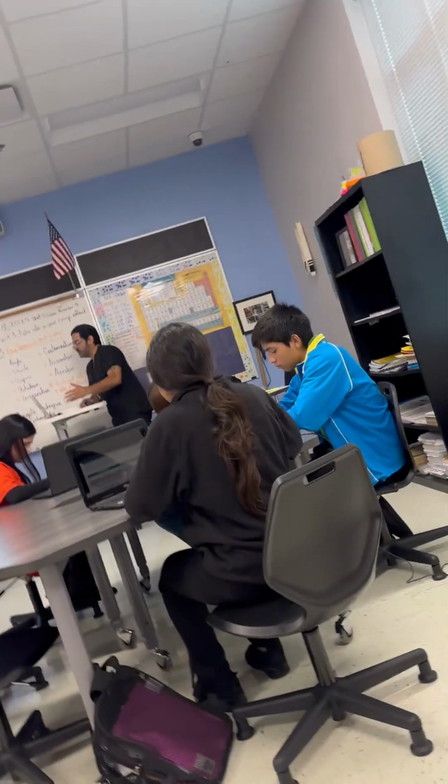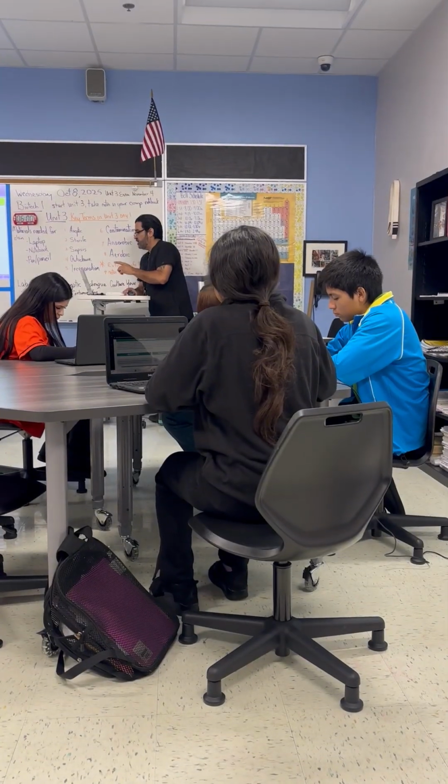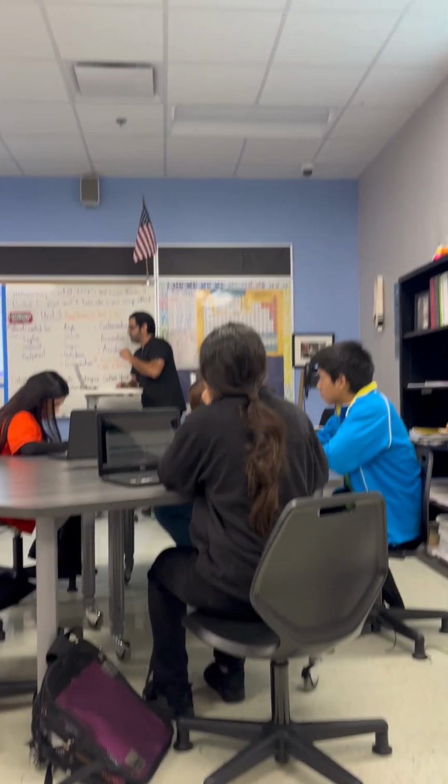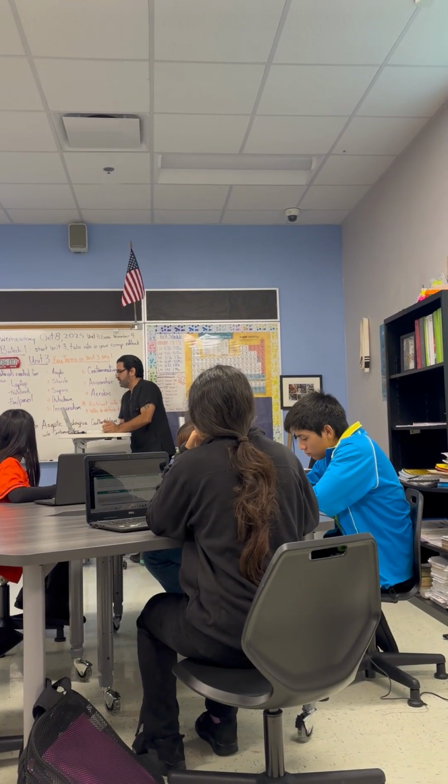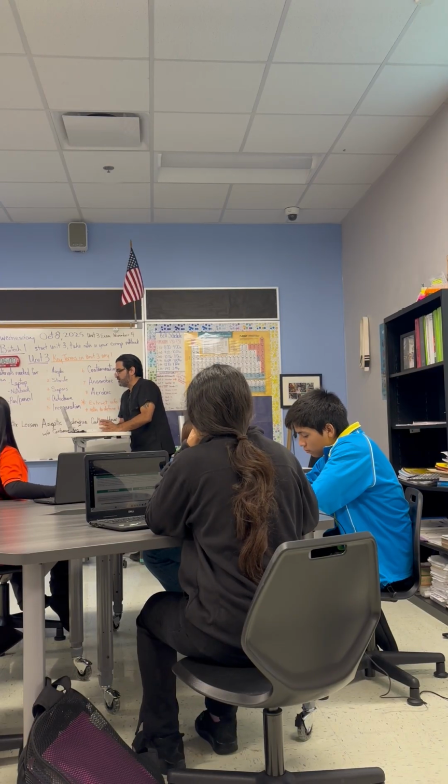We're going to do as best as possible to create the environment where you can do lab cultures, or any type of science process, in or outside the lab. So that's what aseptic technique is.